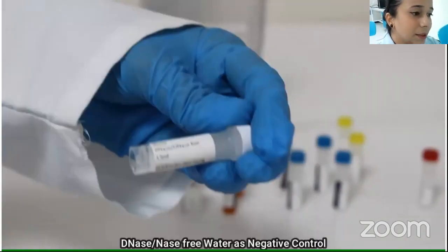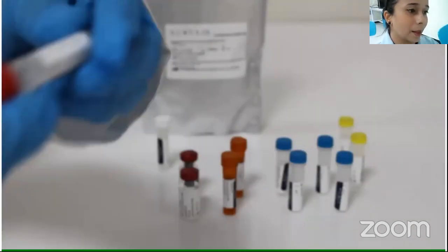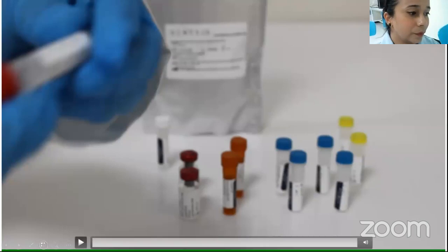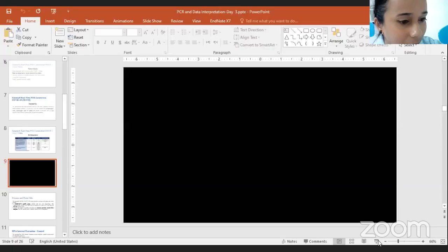The white capped tube is the RNase DNase free water, which we use as negative control, or NTC. And then we have the red capped tube, which is the positive control.